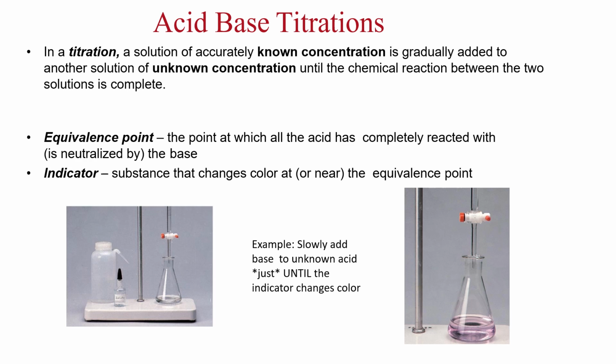The purpose of this video is to tell you about the principles of titration so that you can do the lab exercise independently, being equipped with all the knowledge that you need about titrations in order to understand the experiment and to do the necessary calculations.